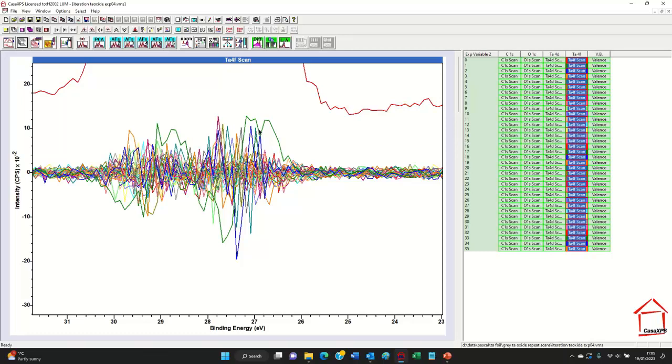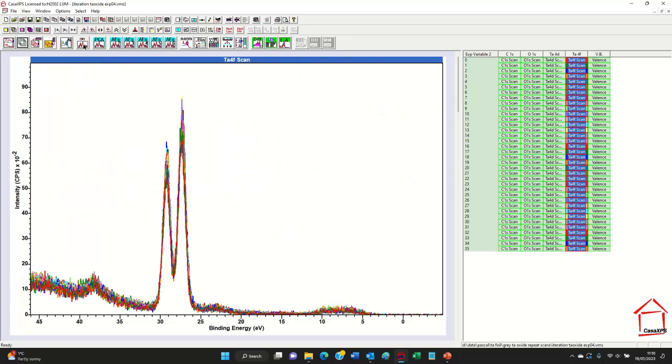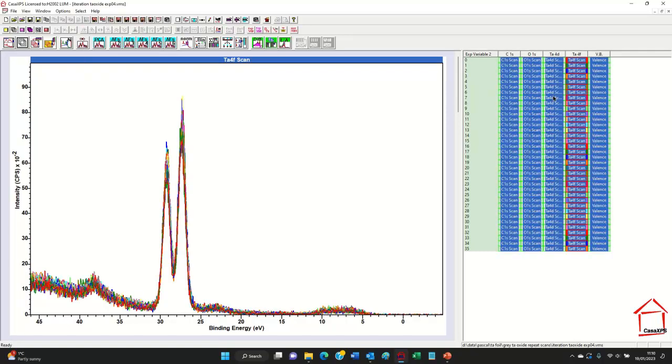Now these abstract factors, there are some variation here, but for the purposes of this video I'll assume that these are good enough that we can sum these data to produce a spectrum, and it'll be true for all of these spectra. So I'll now illustrate another one of these toolbar buttons. I'll reset the data by using the toolbar, and if I select all of these spectra and then use a third toolbar button that says sum columns, then what will happen is a new VAMAS file will be created where the summation has occurred for each of the selected columns.